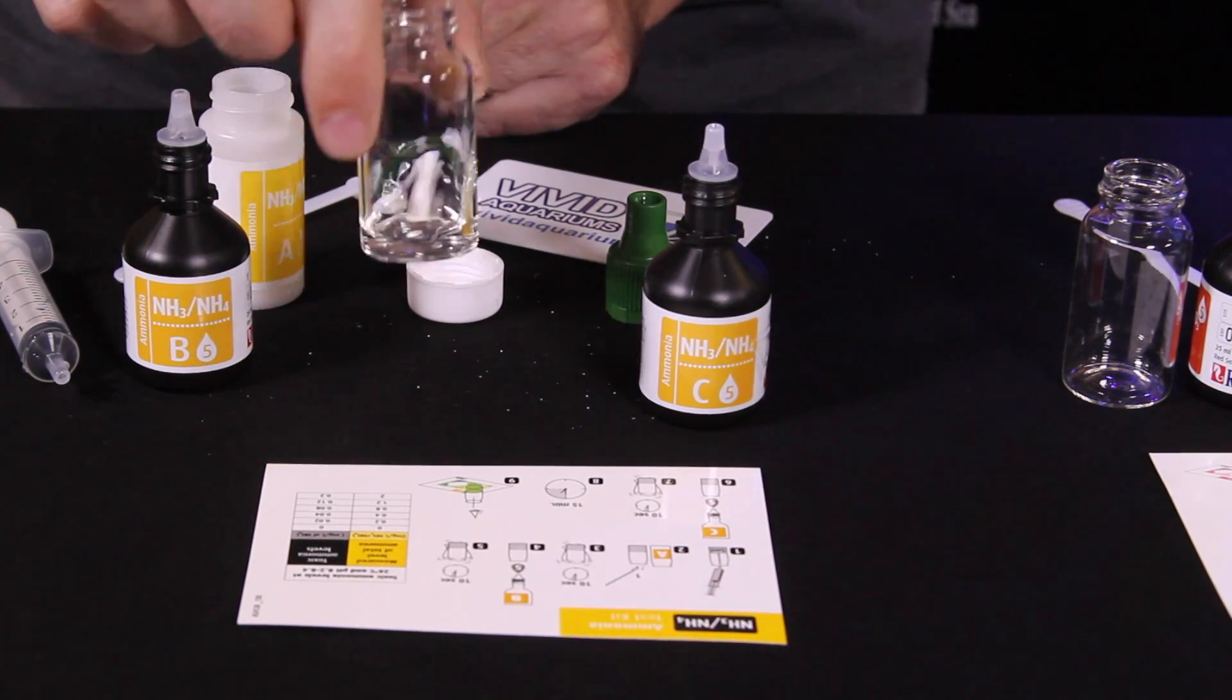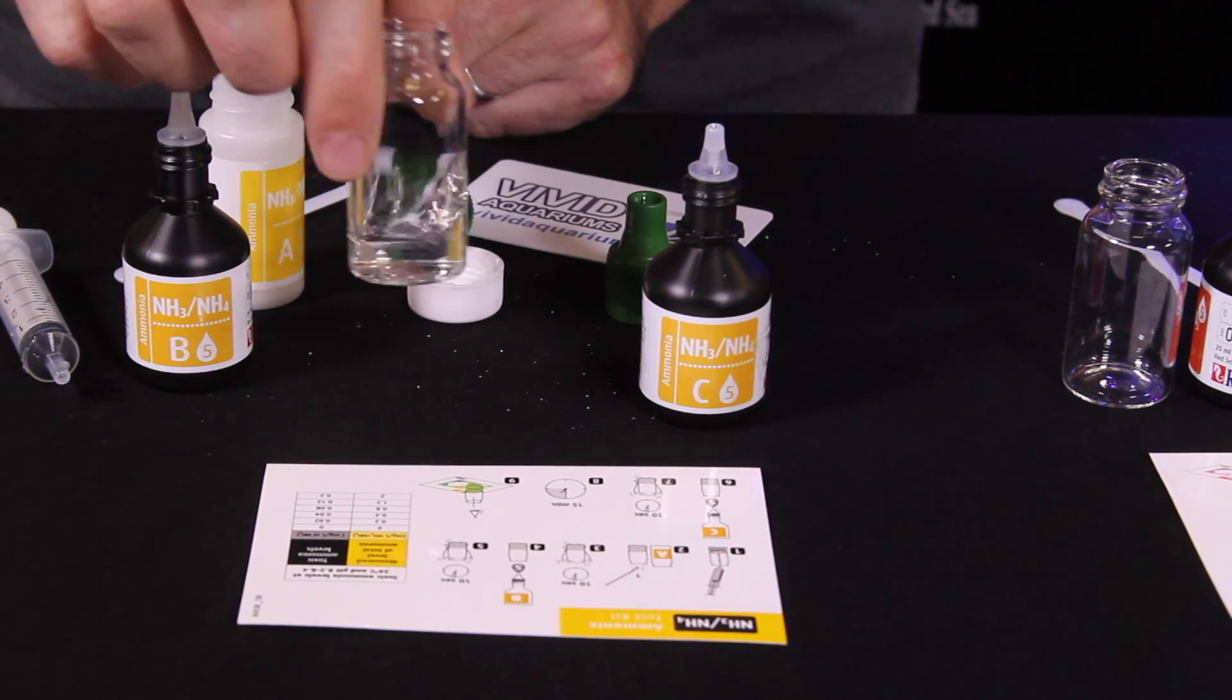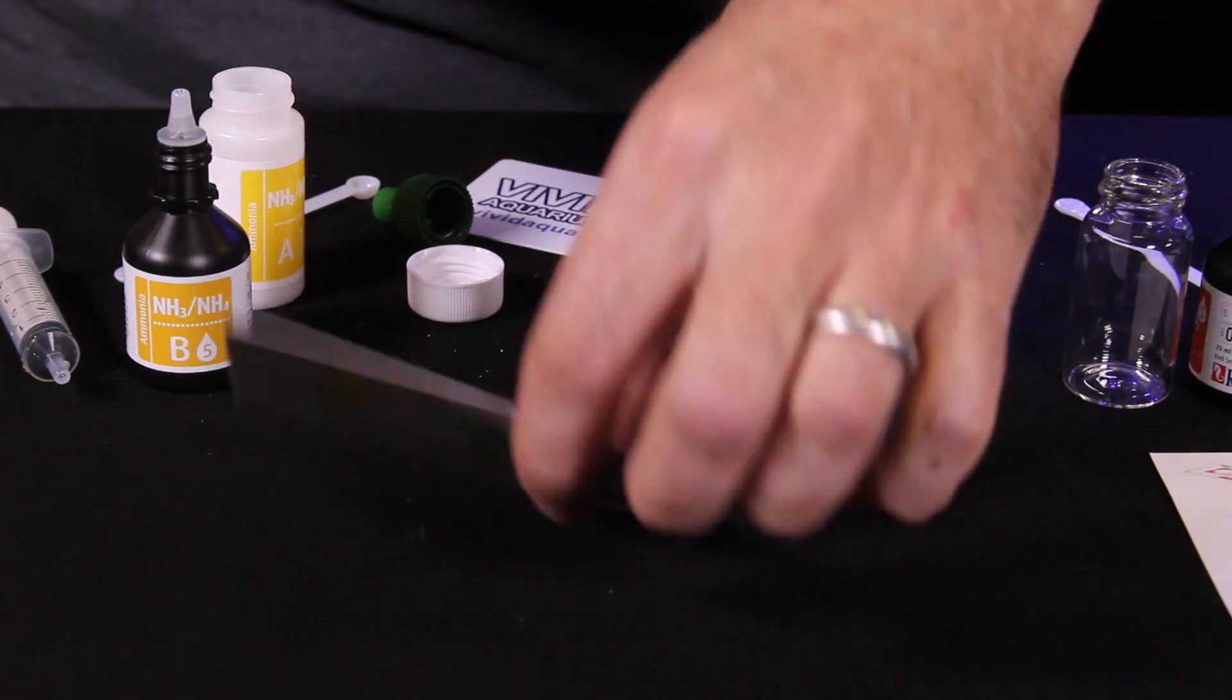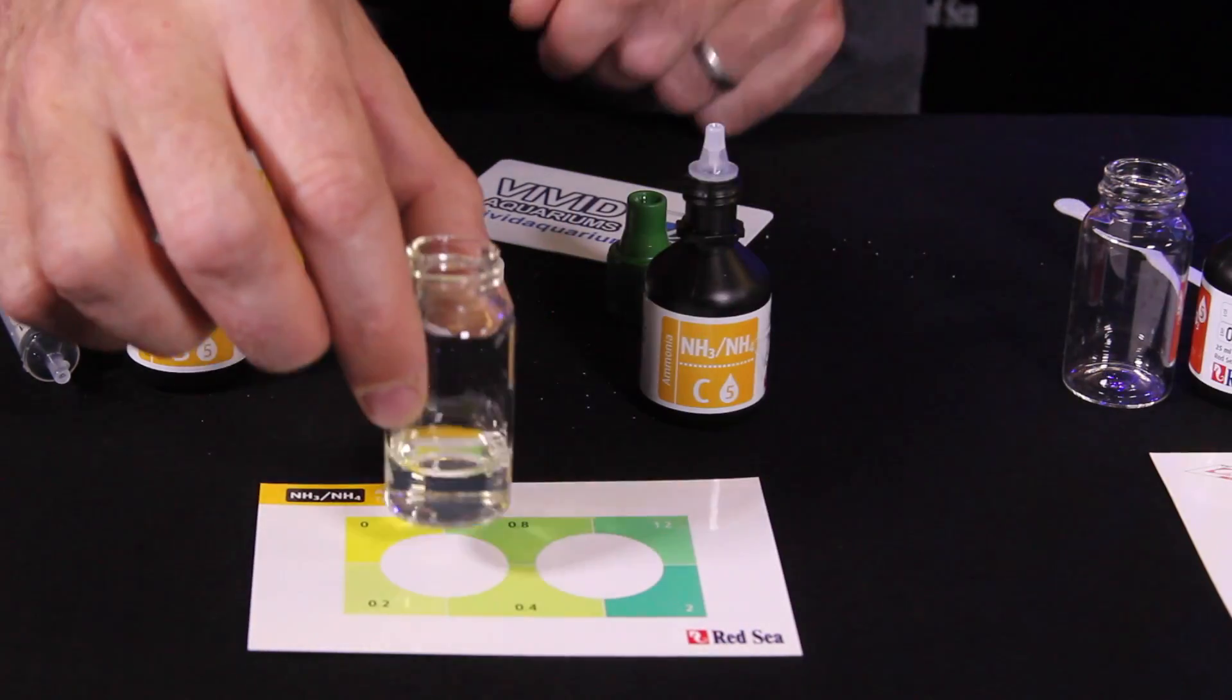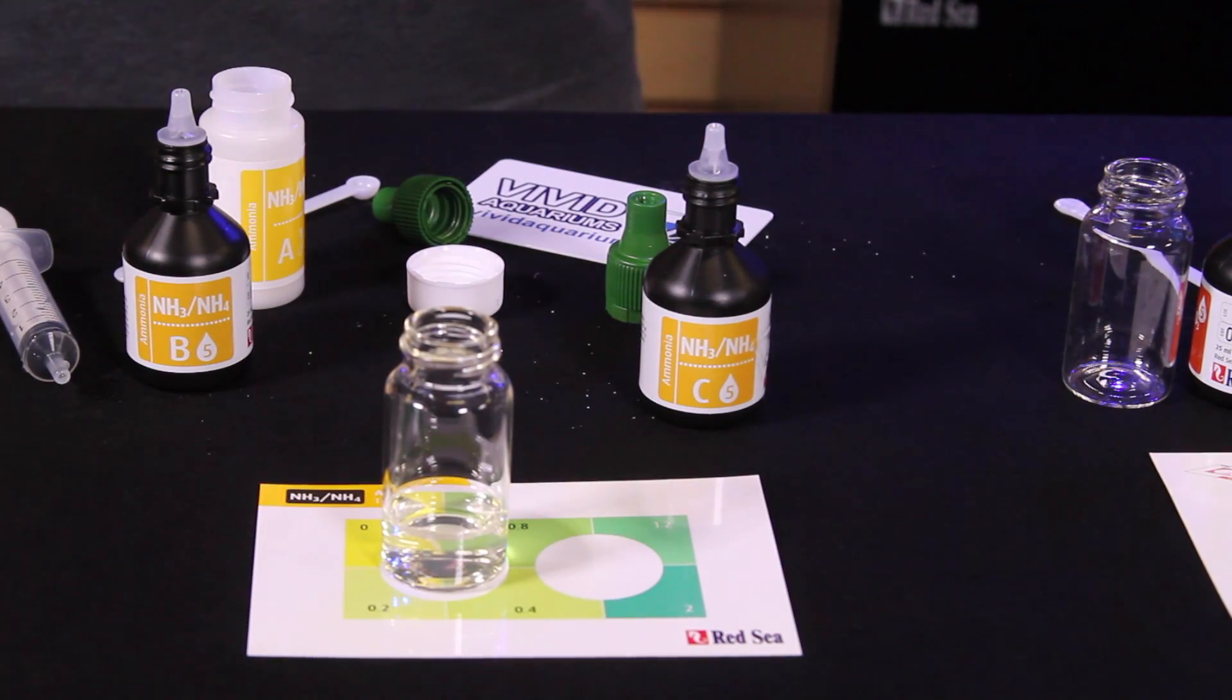Now we need to swirl again for 10 seconds. And then we need to wait 15 minutes to take our test results. So what I'm going to do is turn the card over. I'll set the test vial there on the color comparison chart, and we'll come back and check our results in a few minutes.